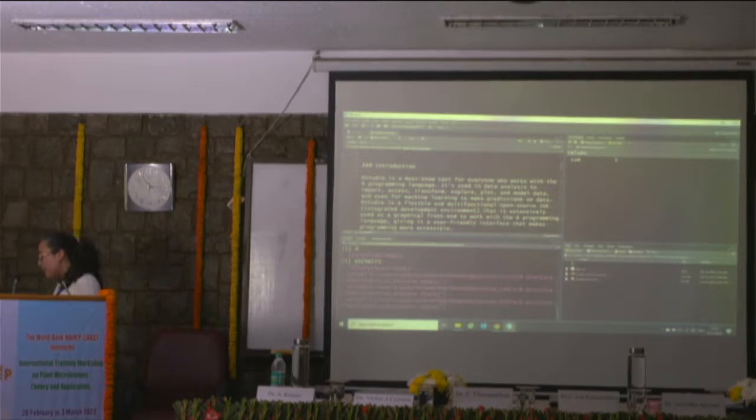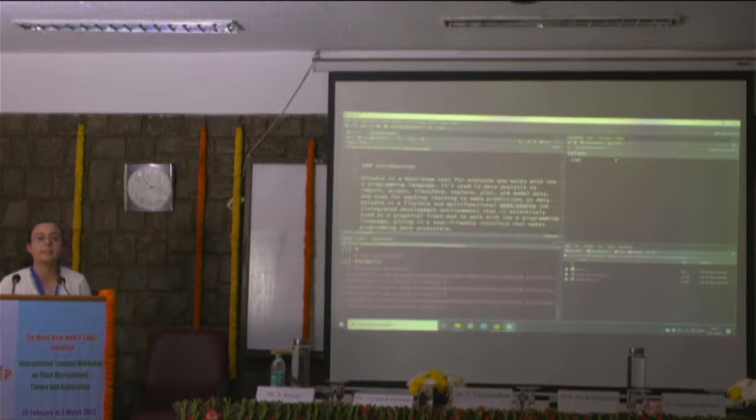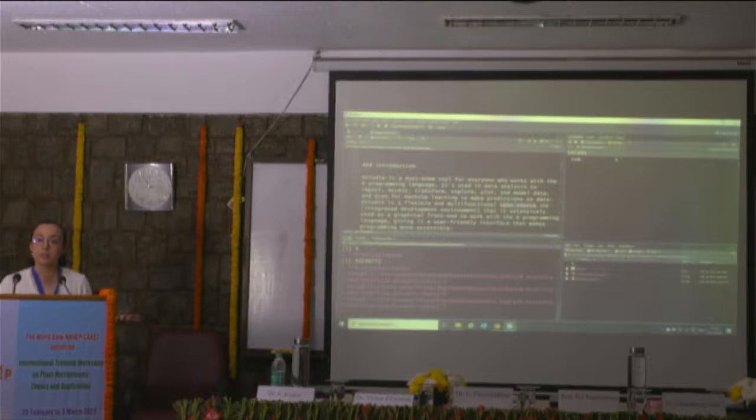And one very good thing about both R and RStudio is this. They are open source, so you didn't have to pay anything to download it and install it. And since it's open source, that also means that people from the community, the users that use this, can make packages themselves and share them with other people, and others can use it and give feedback.